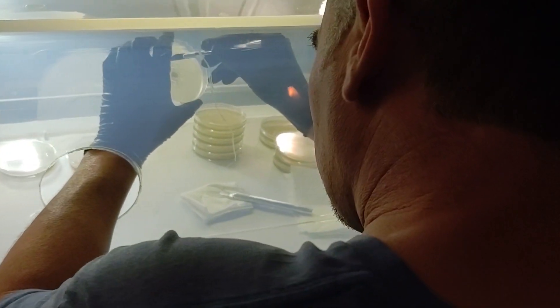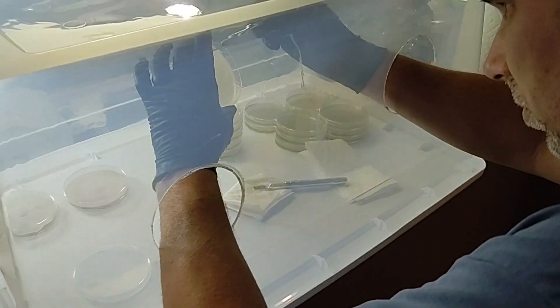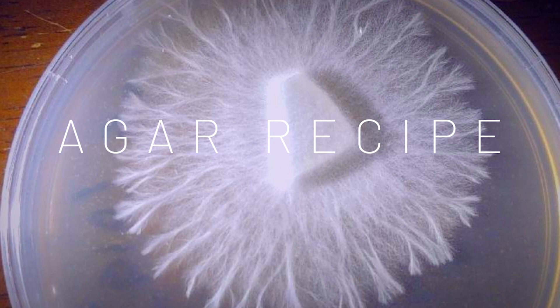Cloning is the transfer of organic materials directly from the cap or stem of the mushroom to a petri dish for the purposes of creating duplicate mushrooms of the best fruits you've already grown. Through multiple transfers you can produce very bountiful flushes.